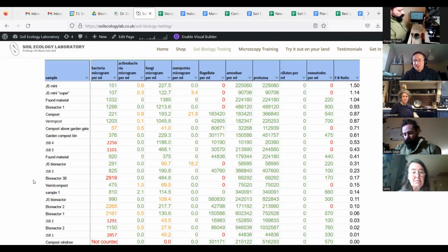So what we have is a set of numbers, and that set of numbers comes from studies of Dr. Ingham in the greatest majority, and some of the other researchers that came after her. And the idea is that the minimum bacteria and fungi that we look at is 135 micrograms per gram of soil or per gram of growing medium.